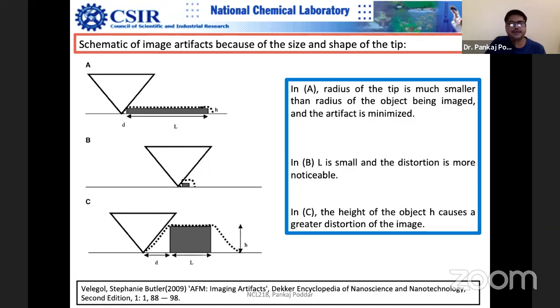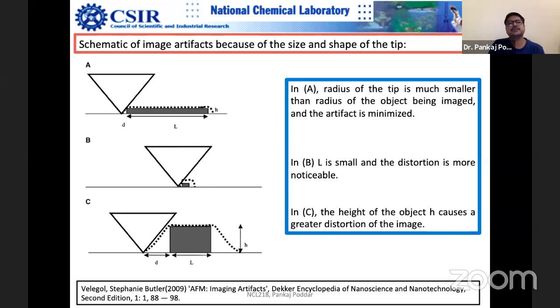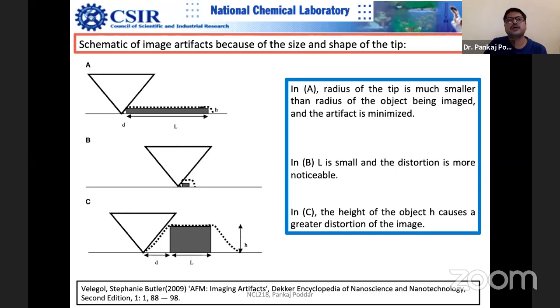AFM physics doesn't have any limitation — it can give you ultra-high resolution, as shown by molecular-level images. The problem is basically the quality of the tip. More effort and money you invest in the quality of the probe, the better quality image you get. Physics is not preventing you from measuring the exact dimensions of a nanosphere — it is tip characterization that matters a lot.